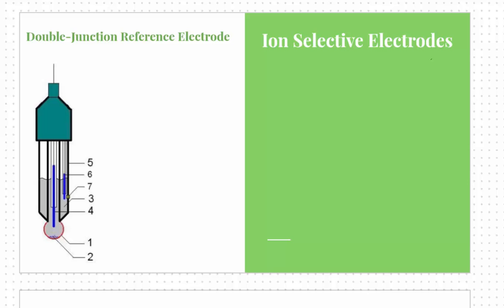And what we're measuring when we use one of these things is the electric potential difference. So we use a calibration curve in order to determine the concentration of a target analyte, and we usually use a modified Nernstian equation. So we have E equal to some constant, and that constant needs to be found experimentally. Usually when it's a cation, we're adding, so plus the log of the concentration of the cations.